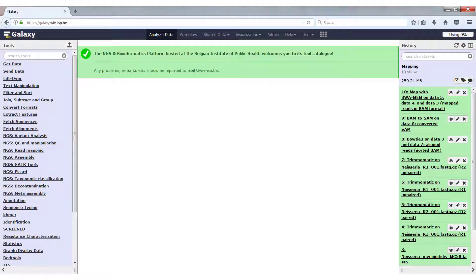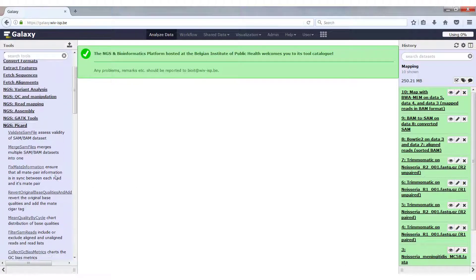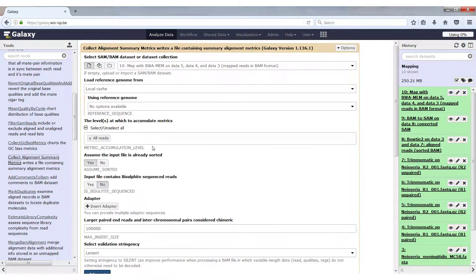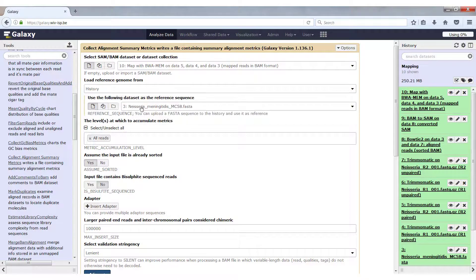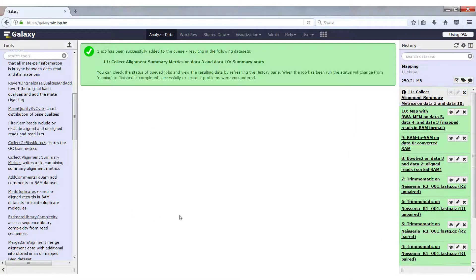The next thing we have to do is check the quality of our output. For Bowtie2 this is an optional parameter, but if you want to have statistics on BWA-MEM, you have to use another tool. You can find this tool in NGS-Picard, and scrolling down we find 'Collect Alignment Summary Metrics'. We select our BWA-MEM data, the reference genome from history — the Neisseria meningitidis MC58 — leave everything else as is, and click Execute.